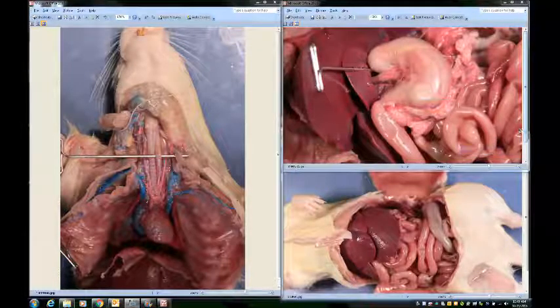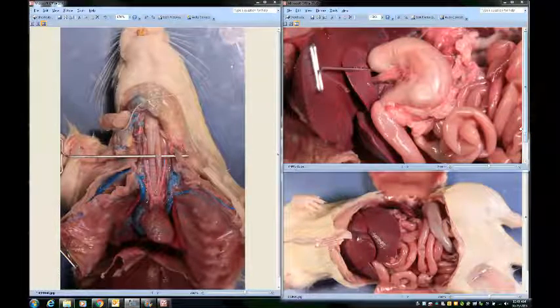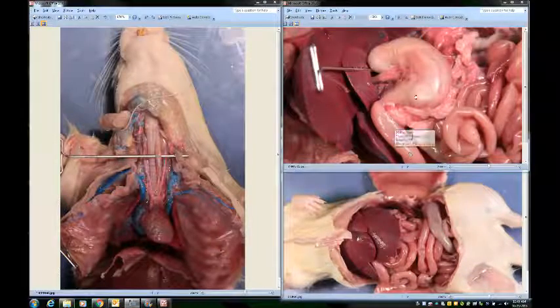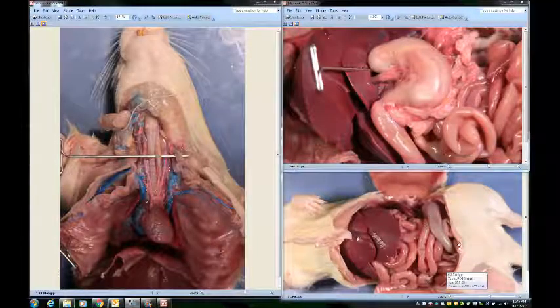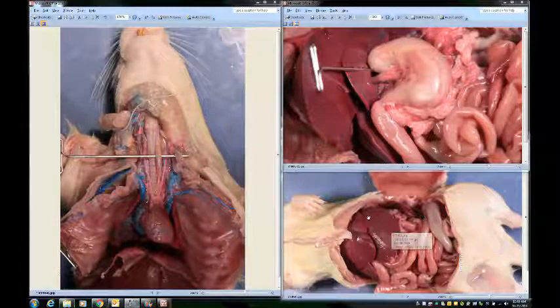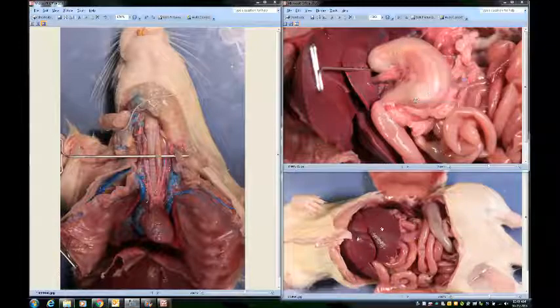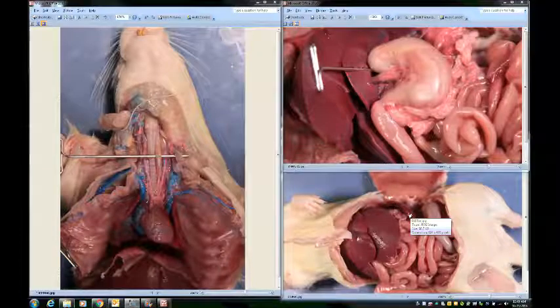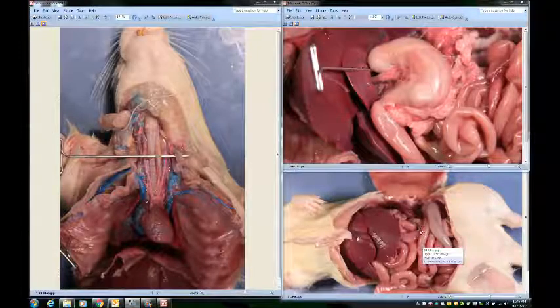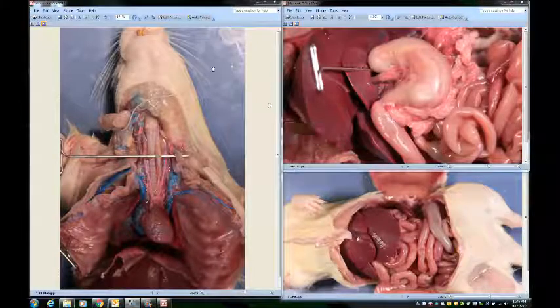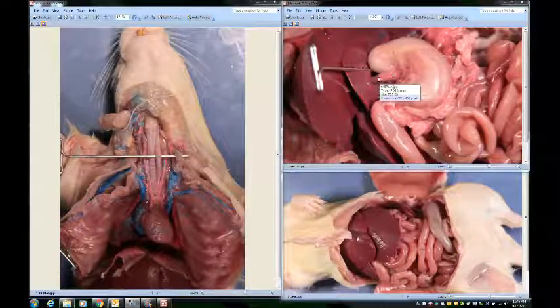The stomach leads to the intestines, which are really, really long — you will remove your rat's intestines and measure them. When put back in the rat, the small intestine is connected to the stomach, and then the large intestine leads down to the rectum. You can also see the liver here, and next to it this little red portion hugging the stomach — that is the spleen. It's not really part of either system, but it's right near the intestines and is another piece you will need to identify.